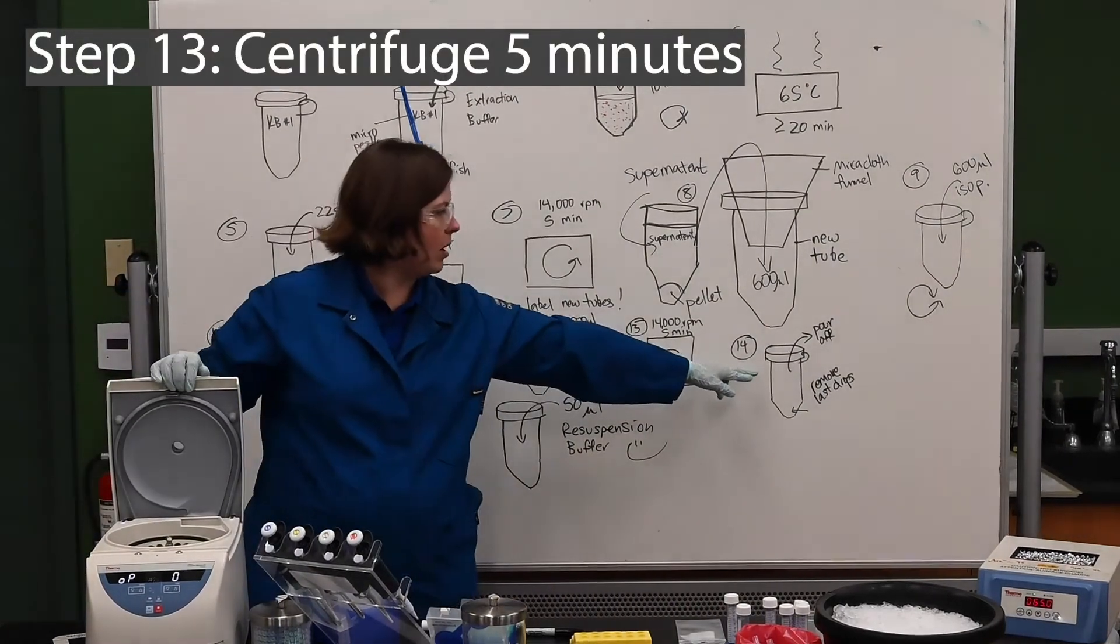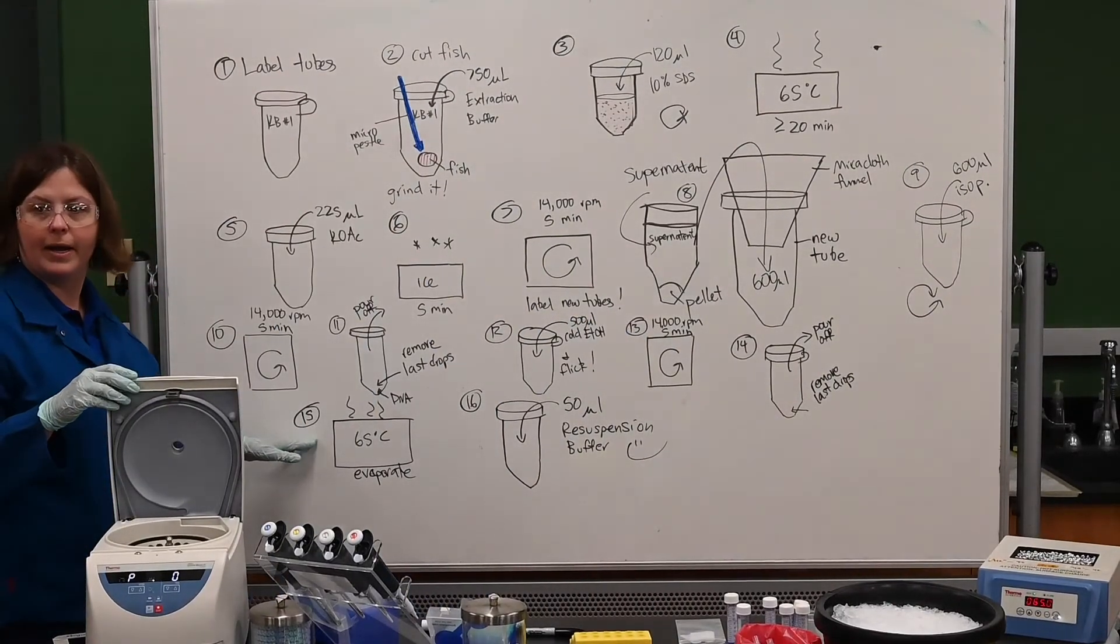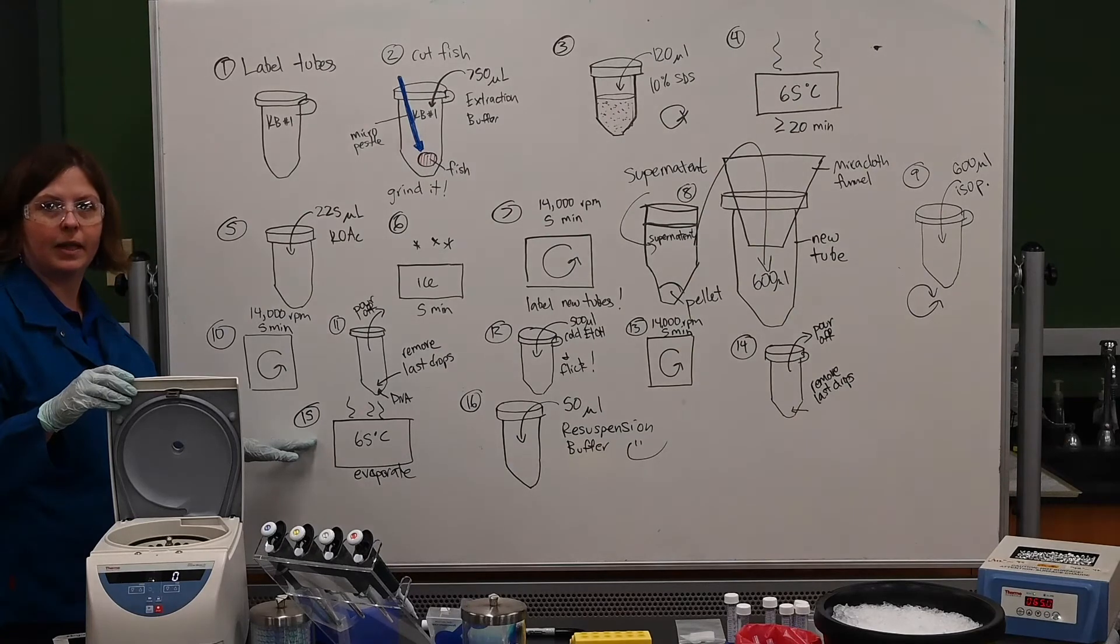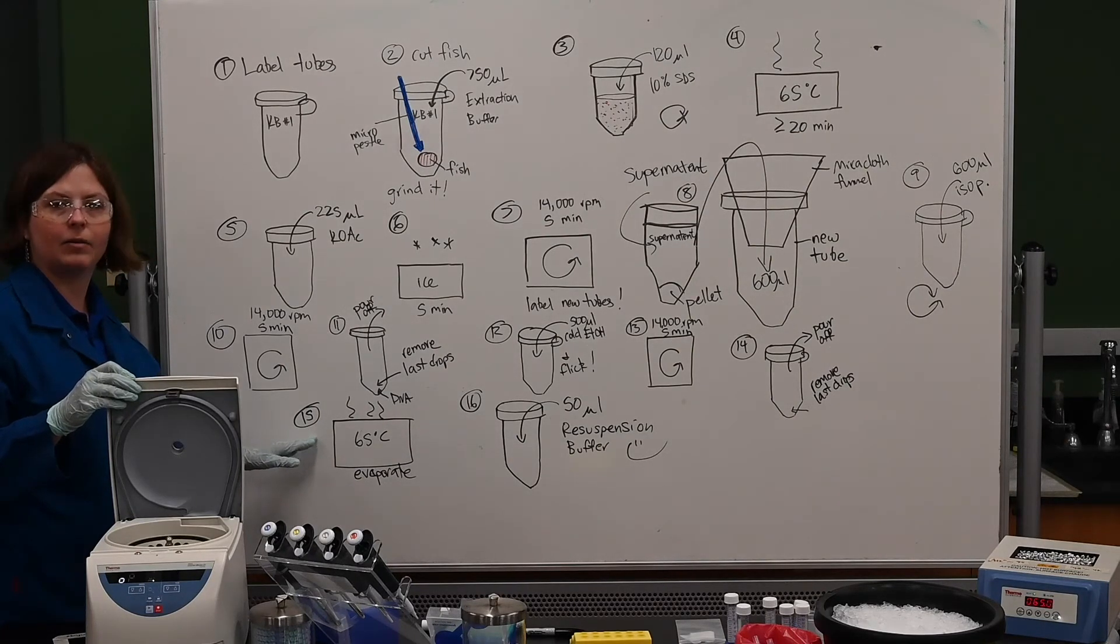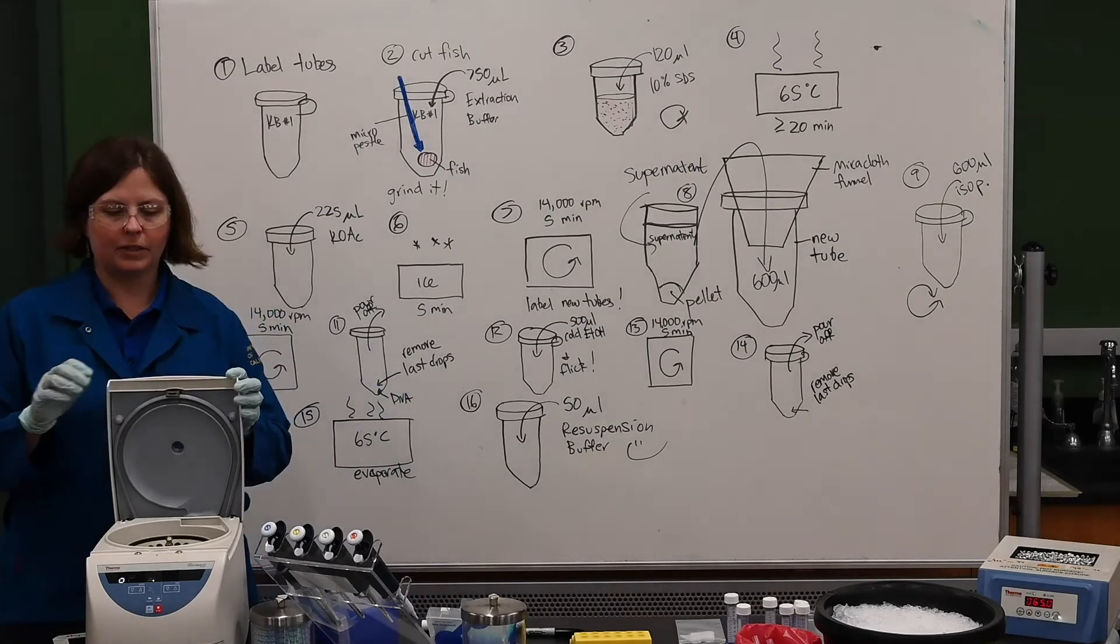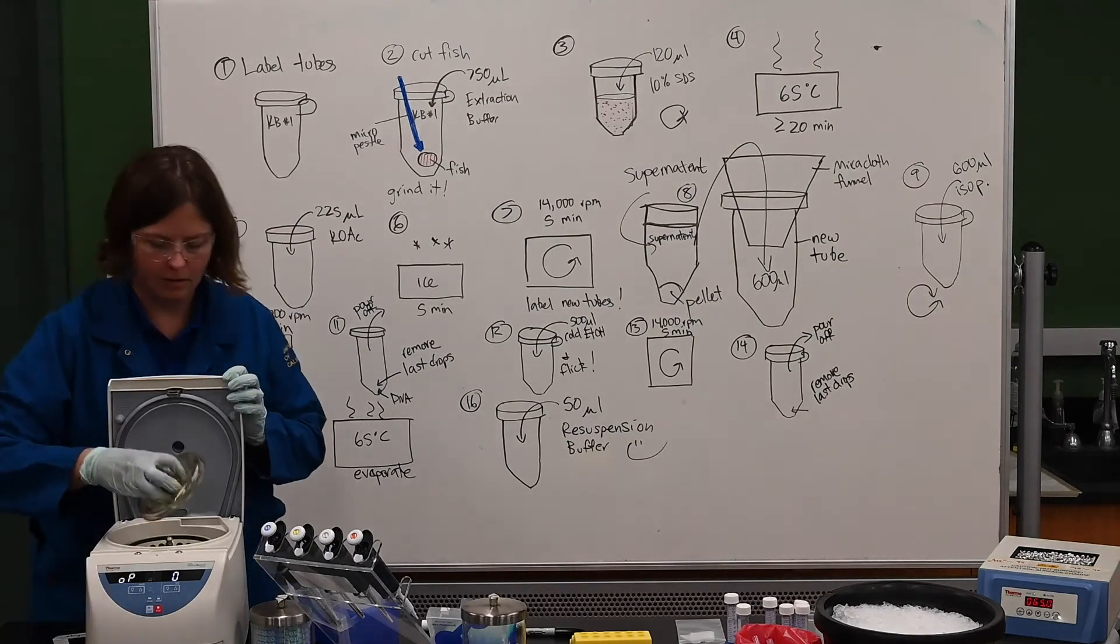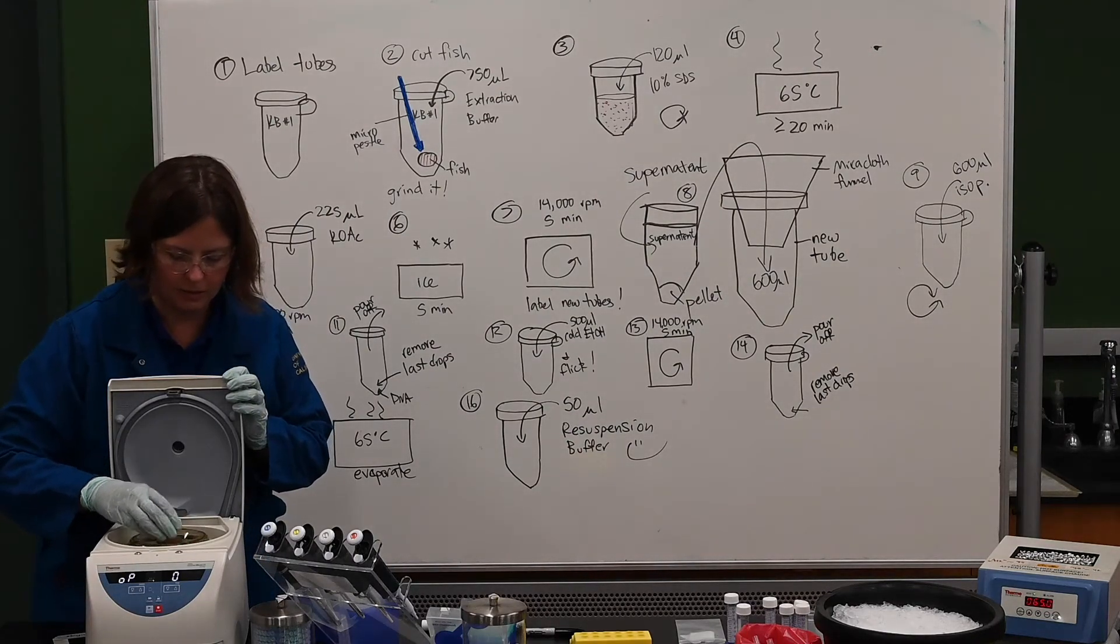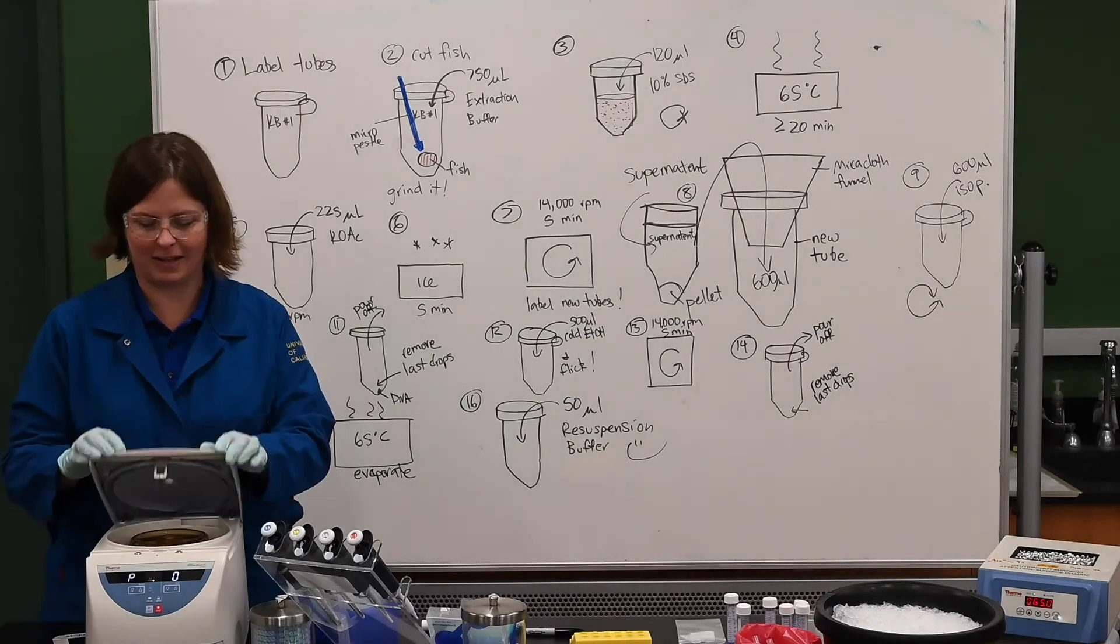I promise this is the last spin. So after this, I'm going to pour off the ethanol. Let it dry in my heat block to try to get the last of the alcohol off. Because alcohol would inhibit or slow down or stop the next step in our analysis, which is our PCR. So once that's completely evaporated, we'll then add some resuspension buffer, which is just liquid that will help keep the DNA from degrading and allow us to use it. And then we're done. So five minutes, last spin.